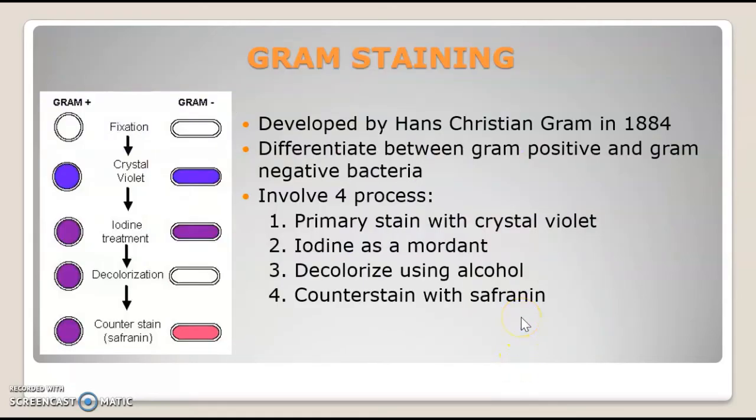The detailed procedure on gram staining is described in your laboratory manual on lab number 6. However, briefly, the gram staining technique could be simplified into 4 main processes.